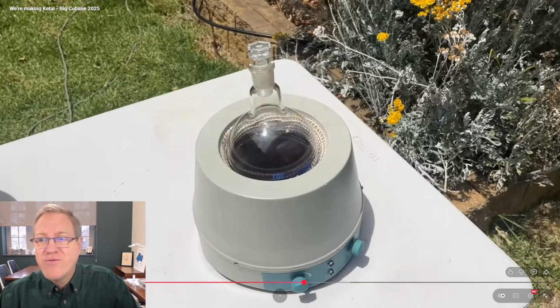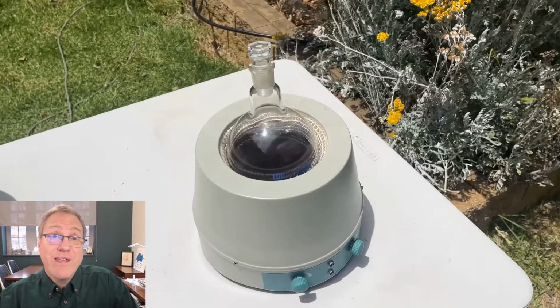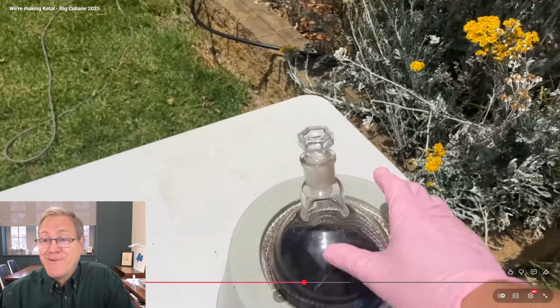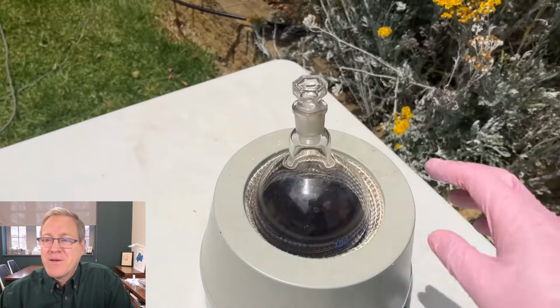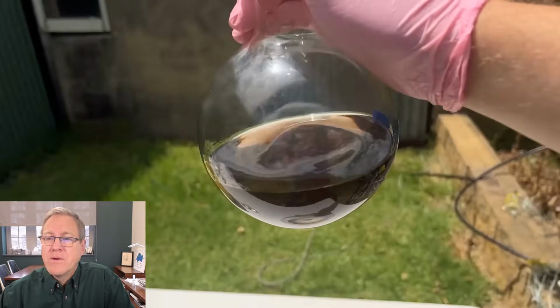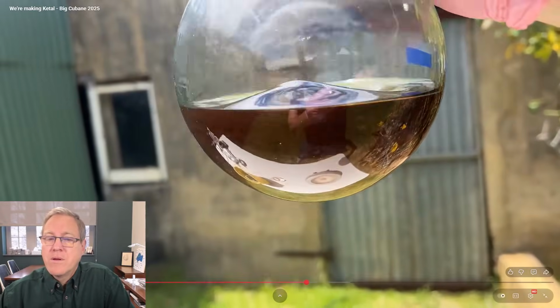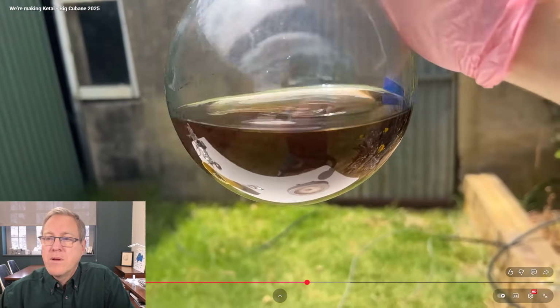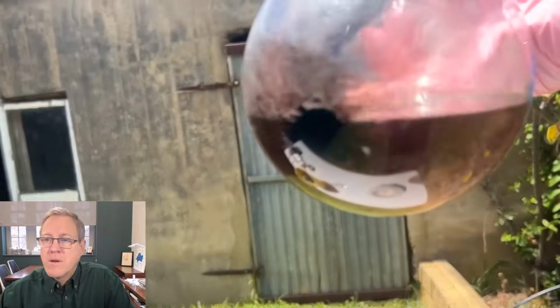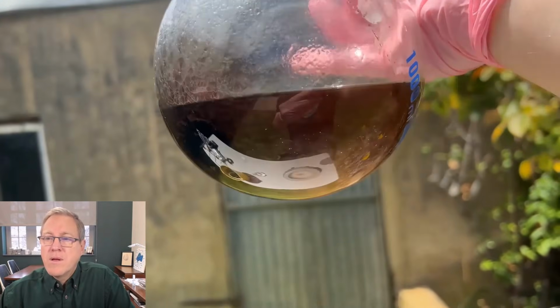He makes comments throughout the video. It is blazing hot when he did this video in Australia, and he is getting cooked in the sun. Fuck me. It's hazardous being out here. Sorry, I'll just get through this. Look, this might be controversial, but I don't think this is too bad. It's a little tarry, but nowhere near as bad as what it could be. There is some tar around the sides, and there's a little blob of tar that's definitely condensed at the bottom there. I am surprised he sees this tar.